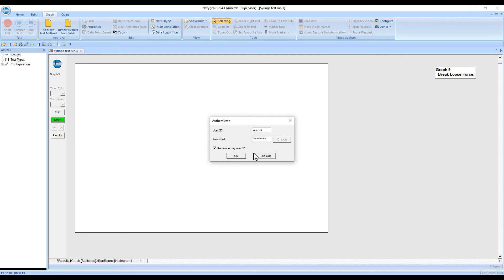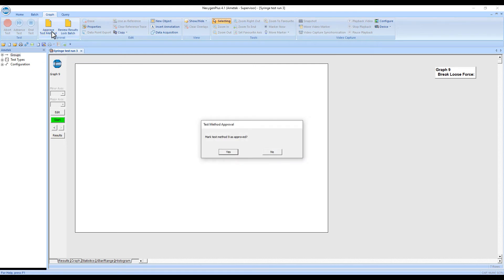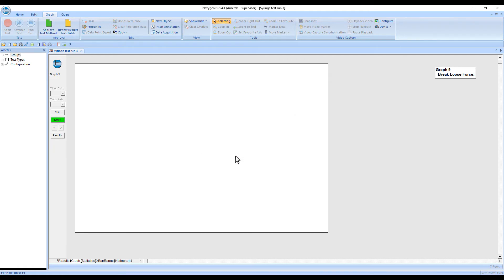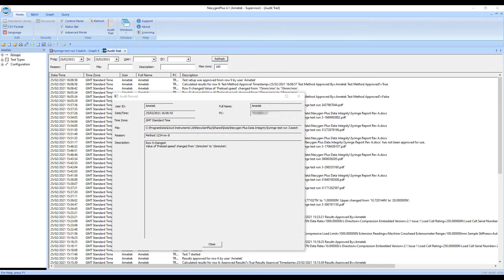Once all changes are made, the user approves the test method and adds their electronic signature. The audit trail logs the value of each critical method parameter changed both before and after the change. The electronic signatures at each step are also logged.